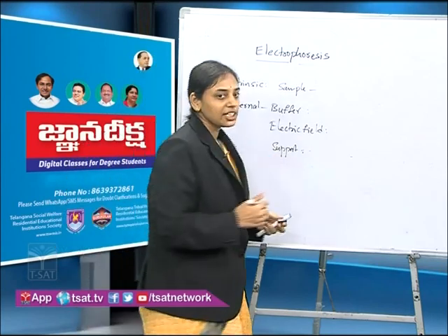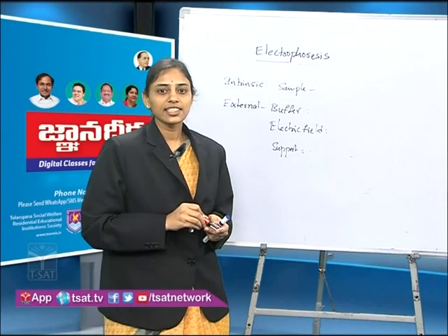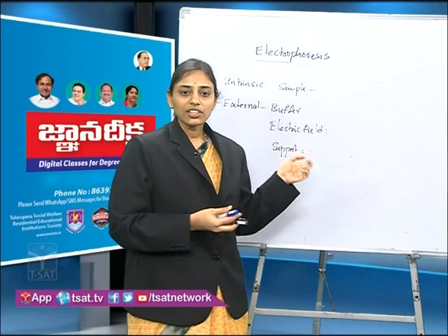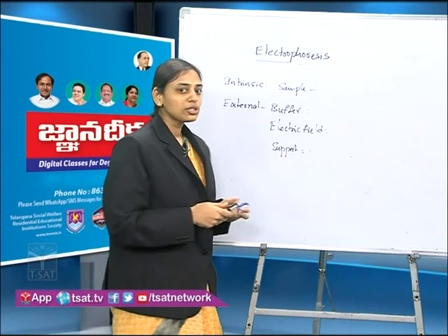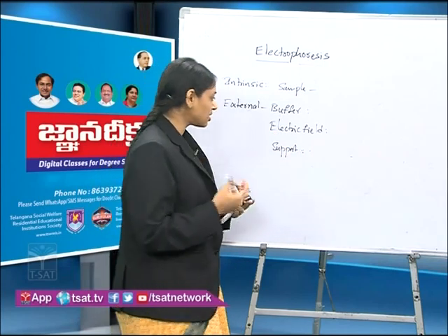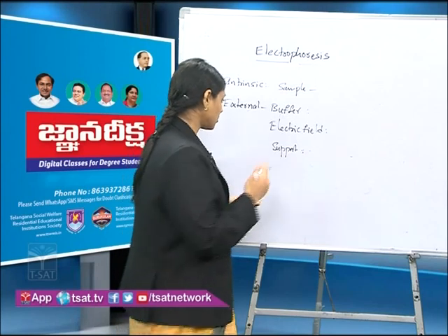And the ionic strength of the buffer should also be considered. The buffer's ionic strength should not exceed the sample's ionic strength. It will slow the migration of the sample's separation.